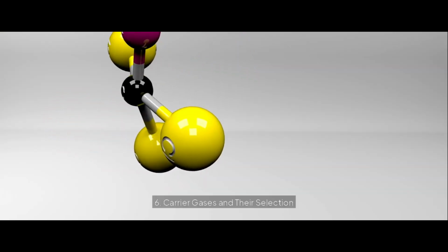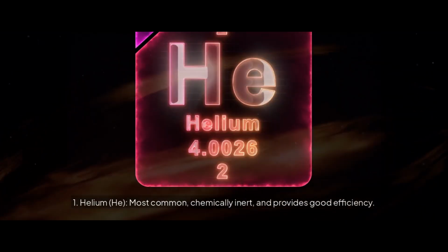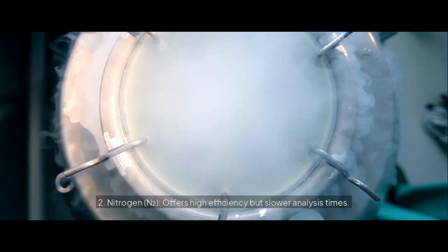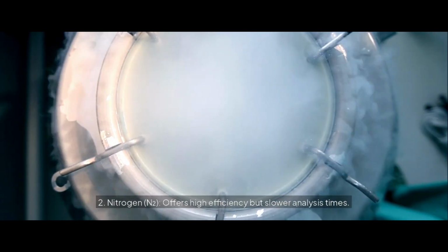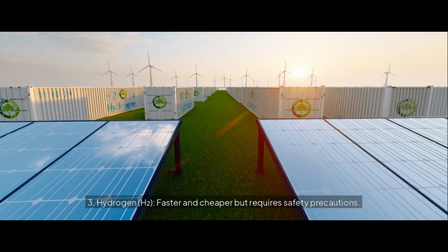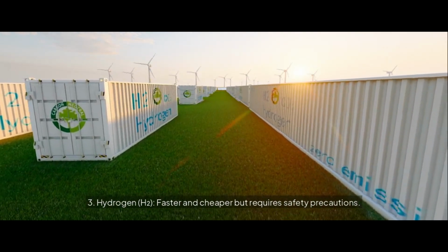6. Carrier gases and their selection. 1. Helium, He, most common, chemically inert, and provides good efficiency. 2. Nitrogen, N2, offers high efficiency but slower analysis times. 3. Hydrogen, H2, faster and cheaper but requires safety precautions.